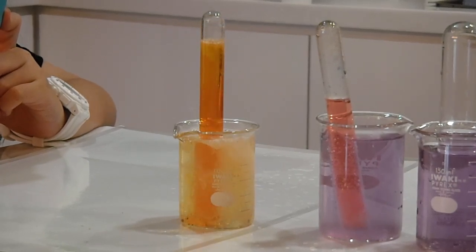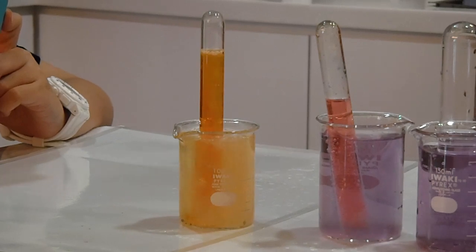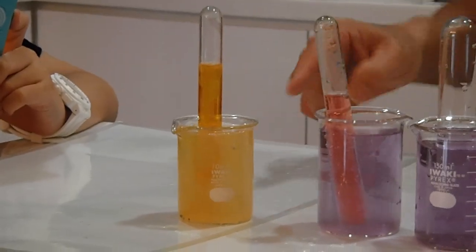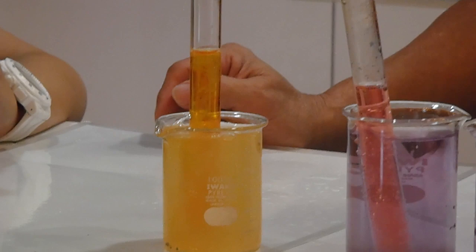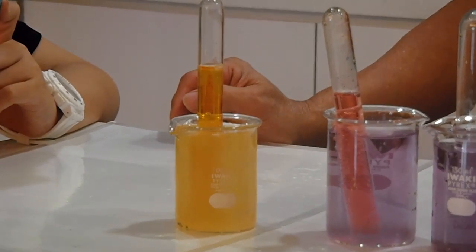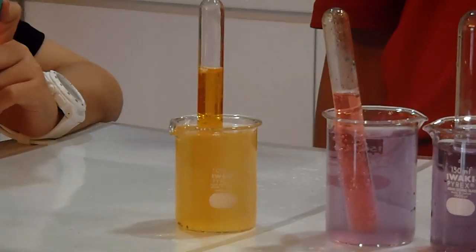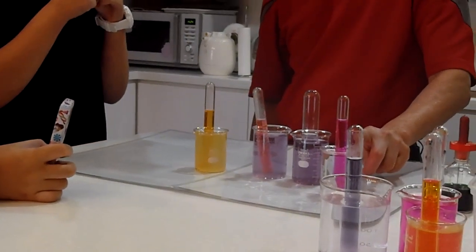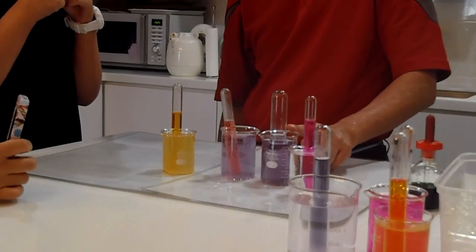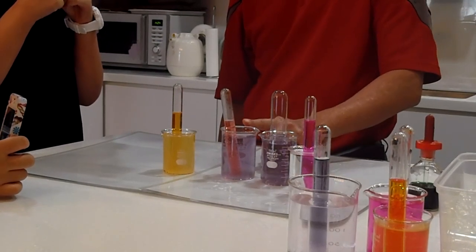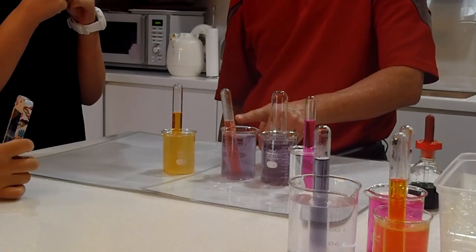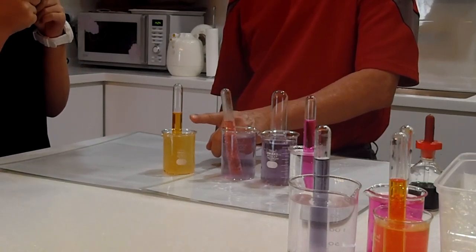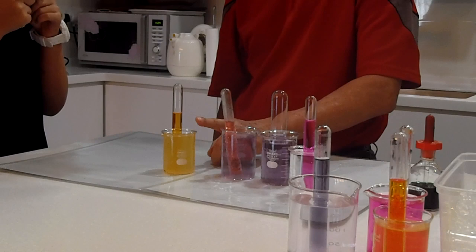Oh, you see the test tube changes color? From orange to yellow, right? Can you zoom in? Can you zoom in with the camera? It changes from orange to yellow. Alright, let's recall. This test tube on the right changes from colorless to pink. This one changes from green to purple. This one didn't change very much. Red becomes a little bit orangey outside purple. And the one on the left changes from orange to yellow. Okay.